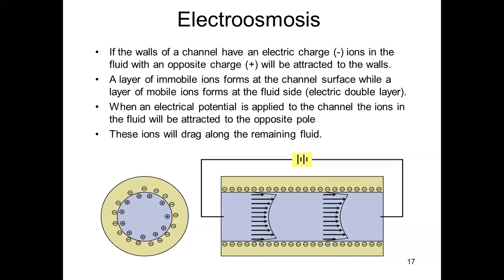That has big implications because when this fluid goes around a bend, it's going to mix or not mix according to this fluid front. So this has long-range implications for our discussion of fluidic mixing later in the presentation. So this is basically fluid driving, moving the fluid, but we also have to look at fluid mixing later.